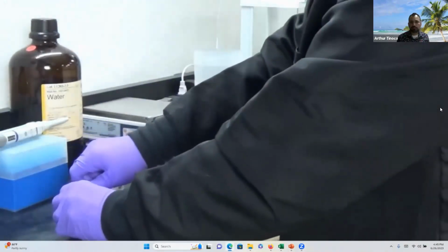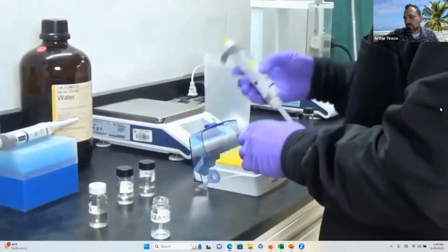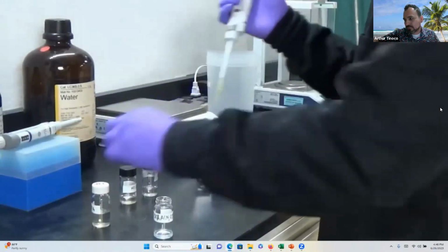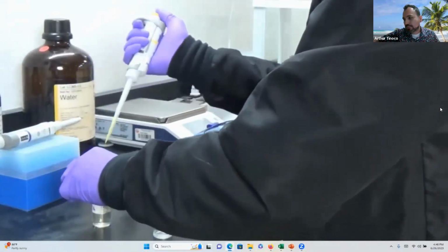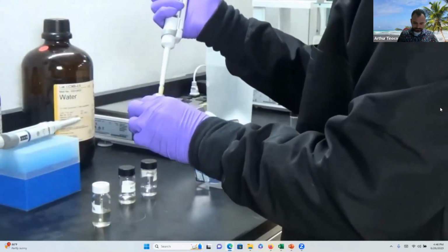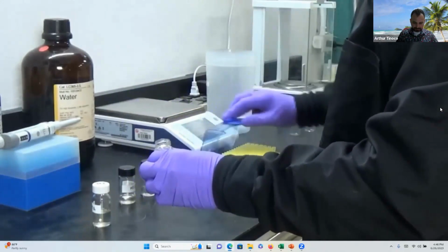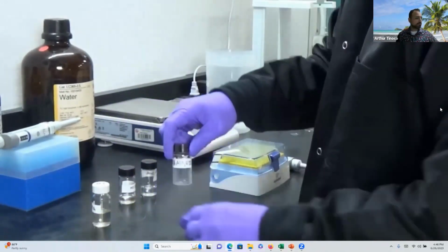In addition, I add in TFA. It is an acid that helps to acidify your samples in order to see proton adducts. What I do is add 2 microliters of the TFA into my mixture in order to have a final concentration of 0.1% TFA.